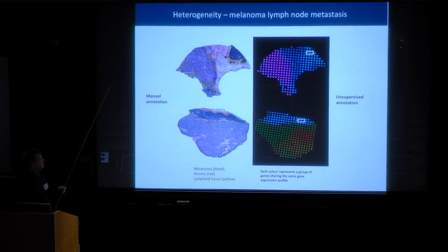And this is how that could look. As a positive control, you could look for lymphoid tissue here. You see that it's a light blue color, and you see the same light blue in both samples, which is a good feeling. We are on track here. But if you look at this tumor, you have one gene transcription profile here indicated in violet, while this tumor has multiple gene expression profiles. You would not have seen this by bulk analysis, definitely, and you would probably not understand this complexity by single-cell RNA sequencing. So this is a beautiful example where spatial components add information.